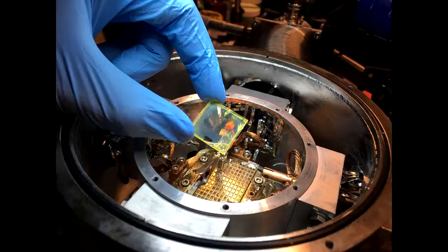We then applied the same fabrication process using an ITO substrate instead of glass to create single-layer LEDs. We tested these under vacuum at a probe station to see how their luminance varied with voltage.